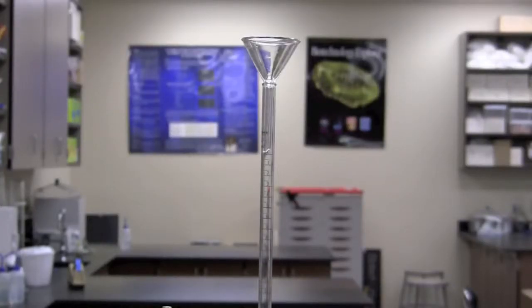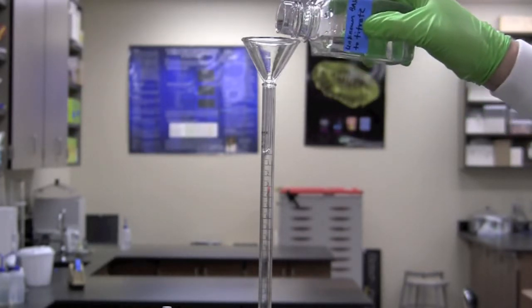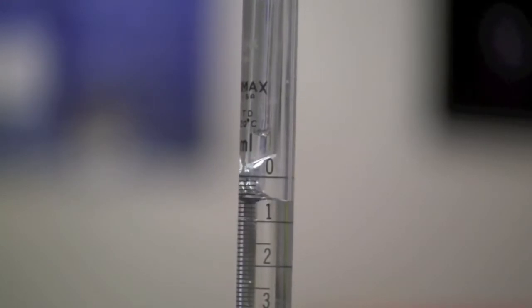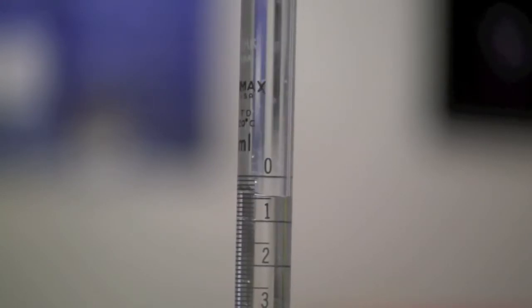Using a funnel or pipette, fill the burette with the base of unknown concentration. In this case we are using a sodium hydroxide solution. The final amounts can be added drop by drop using a pipette.